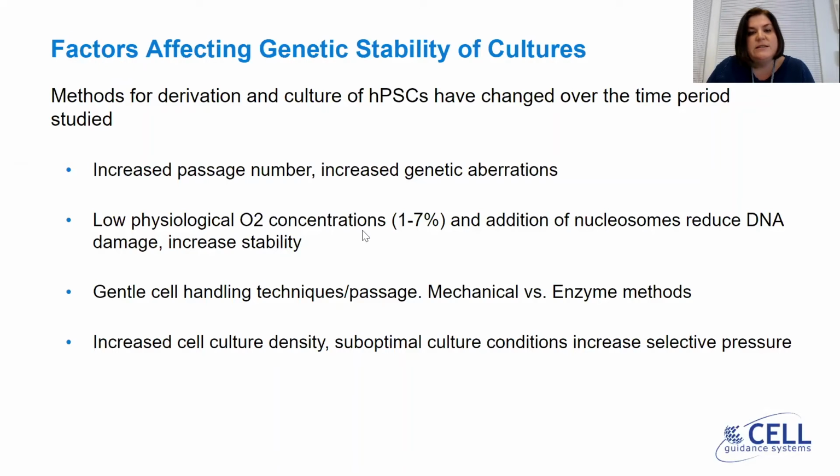We have noticed that with increased time, fewer 60-cell analyses have been performed and more 20-cell analyses. As a rule of thumb, we know that if you analyze 20 cells, you would expect to detect a mosaic clone of just 14% with 95% confidence.